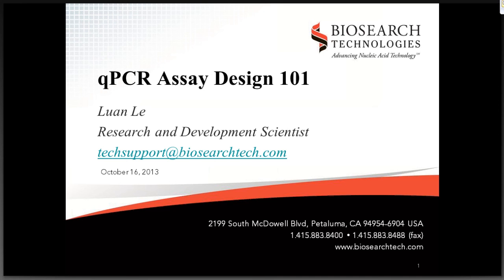Since it's so AT-rich, the probe length is going to be way too long and outside of the parameters. The benefit of a BHQ plus probe design is that it allows for a shorter sequence in these AT-rich regions because you have modified bases that boost the Tm. So you have a short sequence with still relatively high Tm to make for a design.